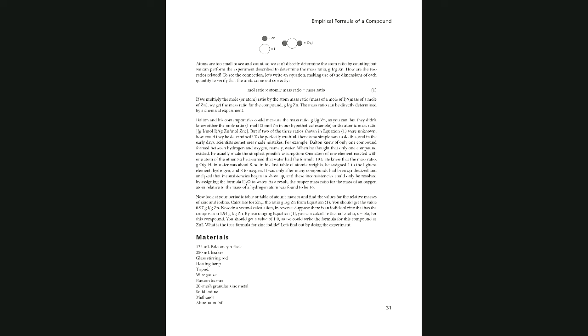So I am going to actually start the procedure for the experiment, and for you to collect your data.